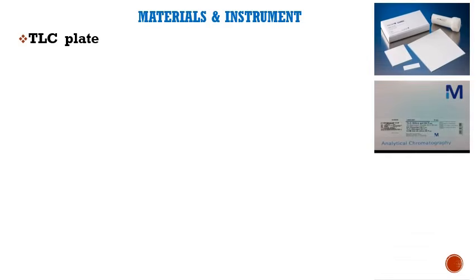Okay, so what are the materials that you are going to need in order to perform a TLC experiment? First of all, a TLC plate. When you buy a TLC plate, it has the shape of a square. Okay, it's big and it has the shape of the square. But such a big plate or sheet, you won't be able to put it in a glass jar.